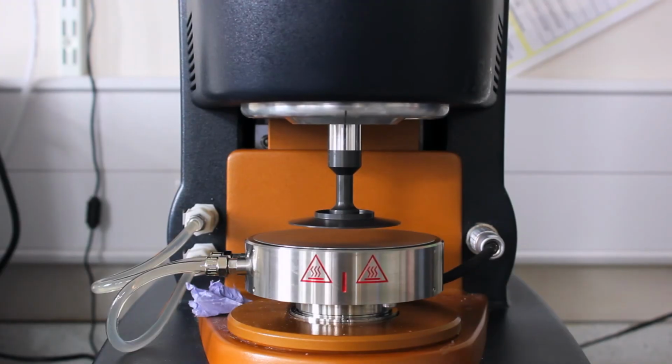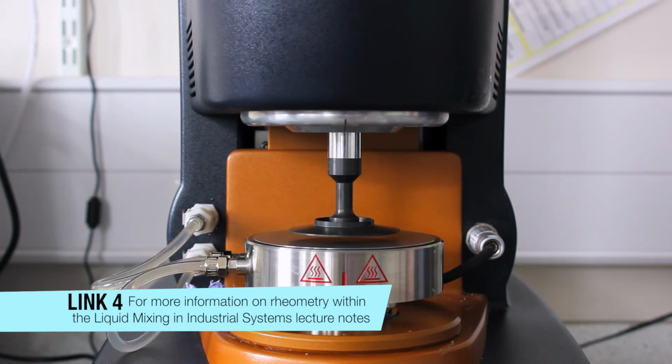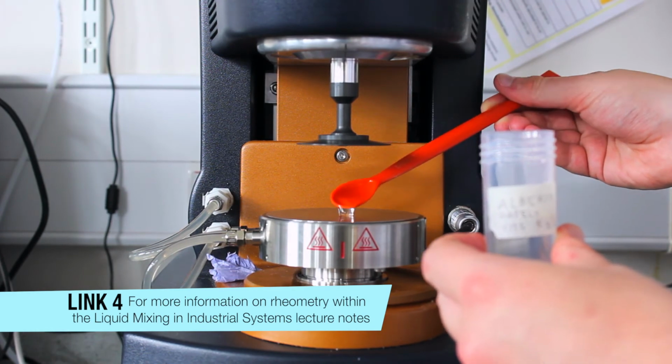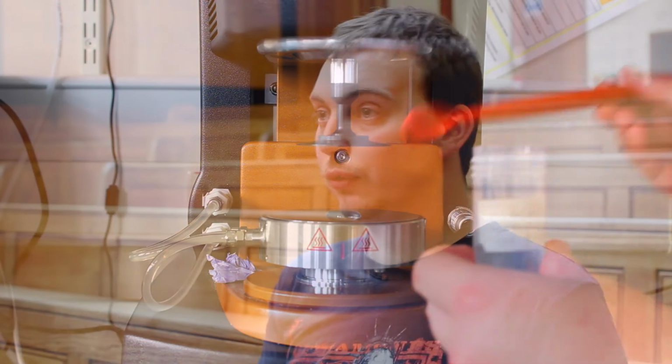So first, because the machine operates at micron tolerances, we have to zero the gap, which just involves lowering the head until the two pieces touch. From there we load our sample into the open gap, and ensuring that we don't either overfill or underfill the geometry, as these are carefully calibrated for the exact amount of fluid.